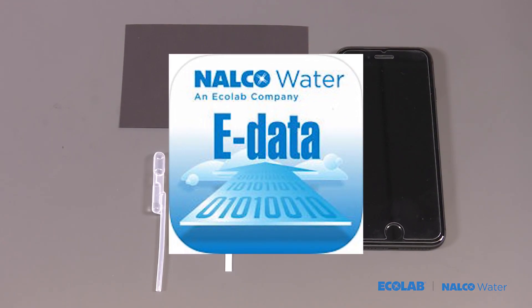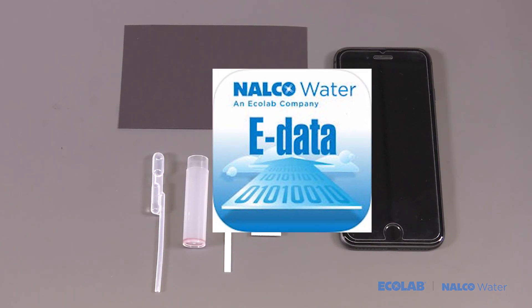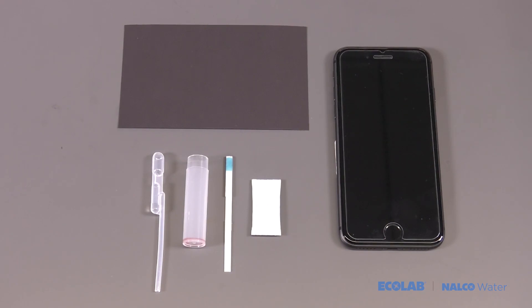After the Nalco Water eData app has been set up on your smart device, you are ready to get started conducting the rapid bio-intelligence tests today.